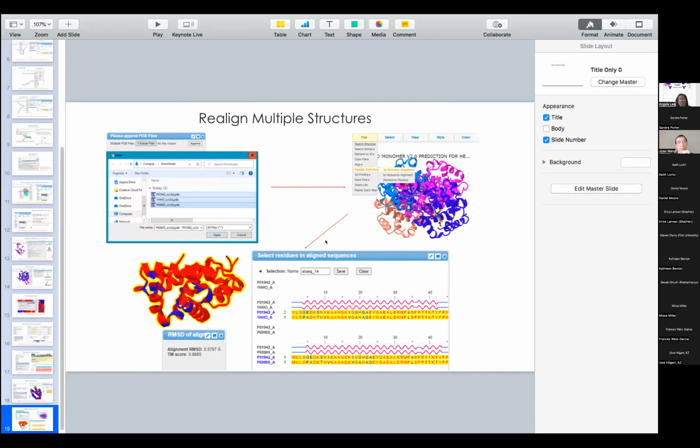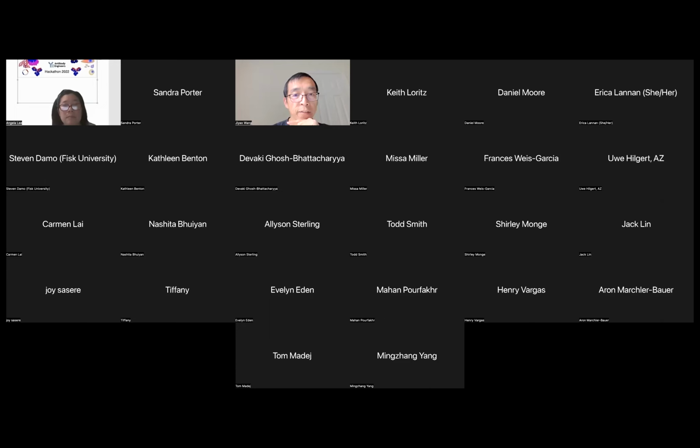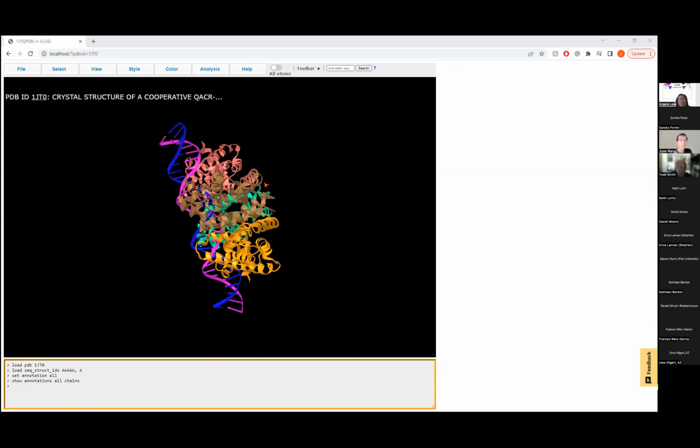And maybe before questions, maybe Jack, you want to show what you have? Sure. Give me 1 second. Okay, can everyone see my screen? Yep.